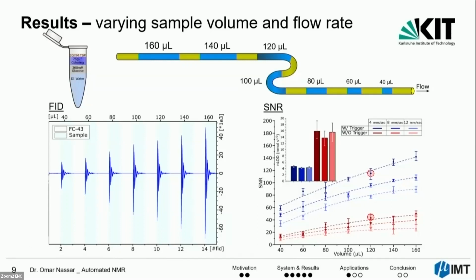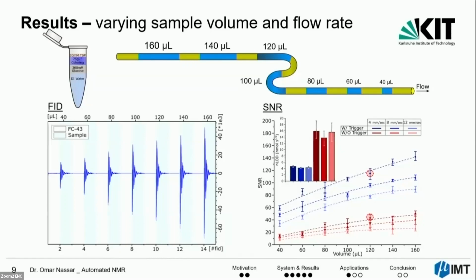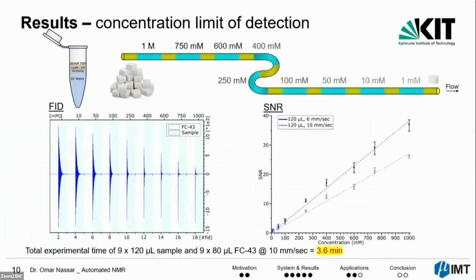Any more questions? I have a comment and several quick questions. One quick question, you don't get cross-contamination of your samples? No, actually the oil which we used here for separation is called FC43 oil. It's an oil which is mainly used for electronic devices to cool them down, so they don't have any electronic properties because they don't carry any static charge. Also, they keep the cross contamination between even the electronic components to a minimum.